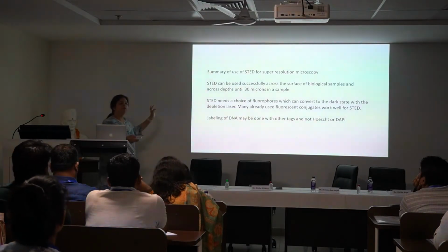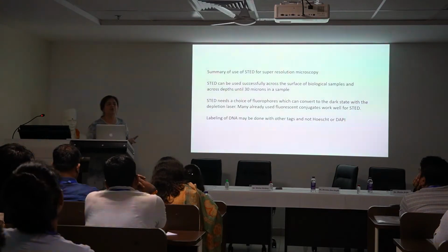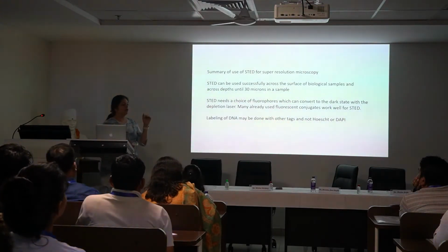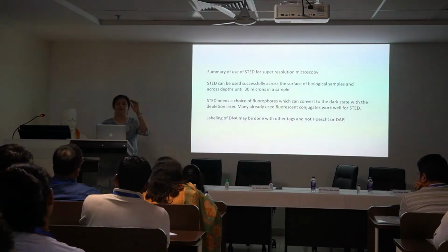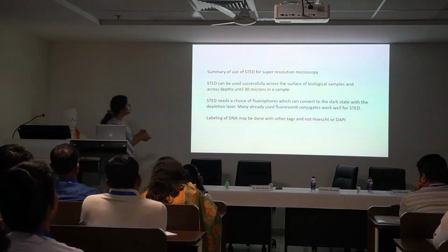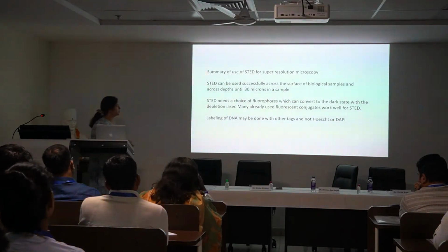But when I'm thinking of embryos or maybe other tissue samples, it's very attractive to try out STED. It can allow for improved resolution and increased depths inside the sample, and this could be almost up to 30 microns inside. You will get better resolution.